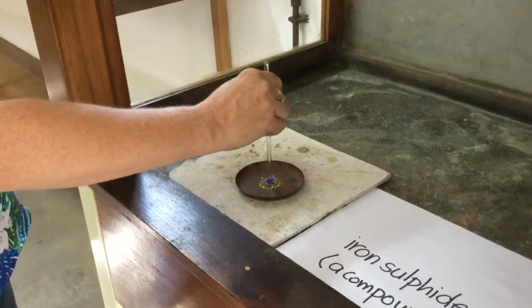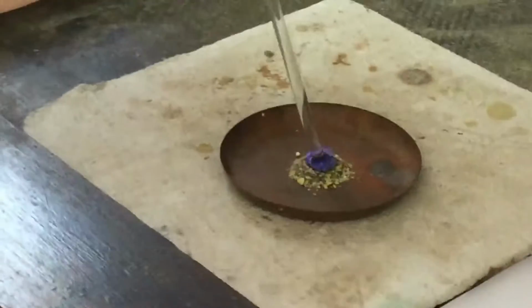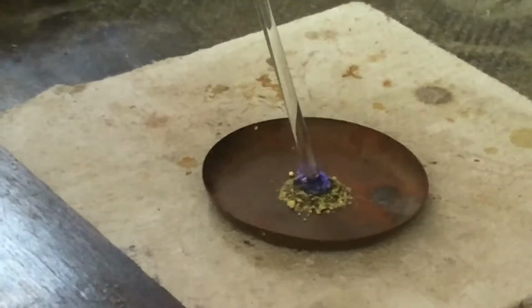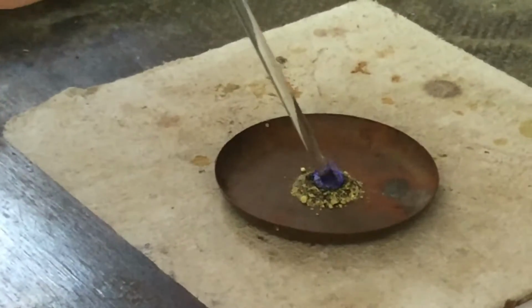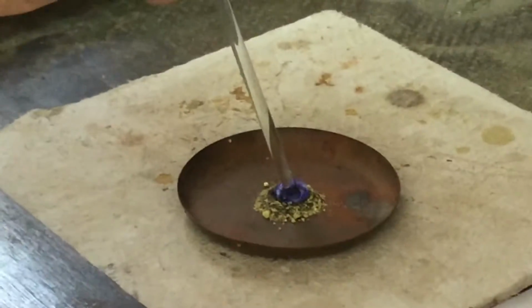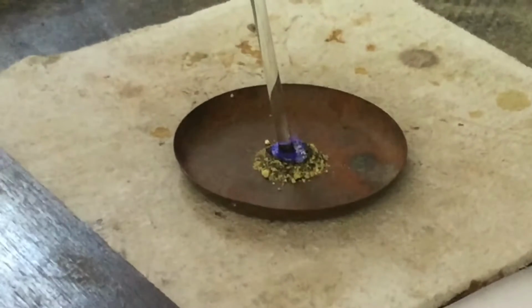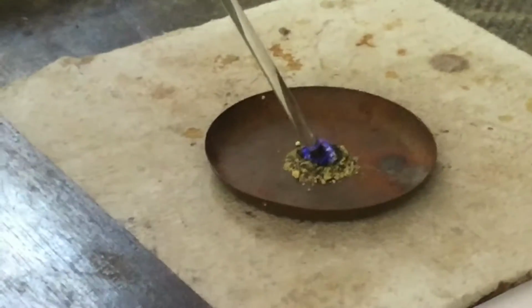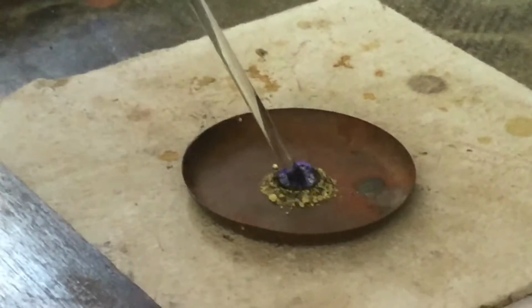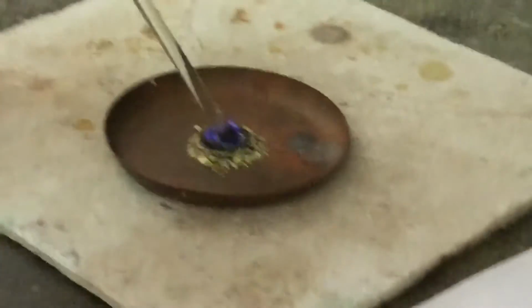So if I put that in there, you should see that the sulfur starts to melt and the reaction will begin. We're doing this reaction in the fume cupboard because sulfur dioxide can be given off, which is a poisonous gas. So we'd rather that the gas is extracted. But you can see now a chemical reaction starting to take place as the sulfur reacts with the iron filings. And what we're doing now is we're forming a compound. So I'm just going to move that into the fume cupboard.